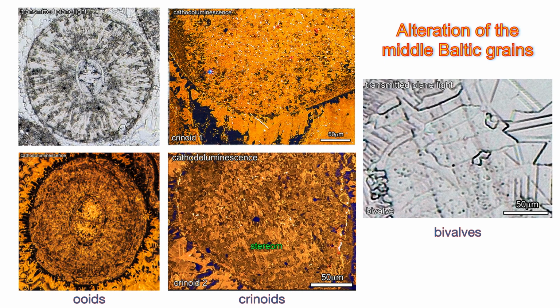The stereome of crinoid 1 from the Baltic sample is unrecognizable, although its breakdown has probably contributed magnesium for the formation of micron-sized dolomite crystals within its ossicle. Crinoid 2 has a poorly preserved patch of stereome. The space between the stereome is filled with cement.